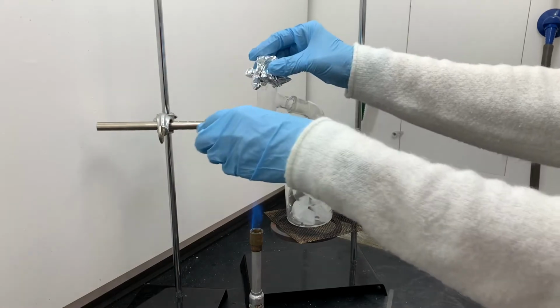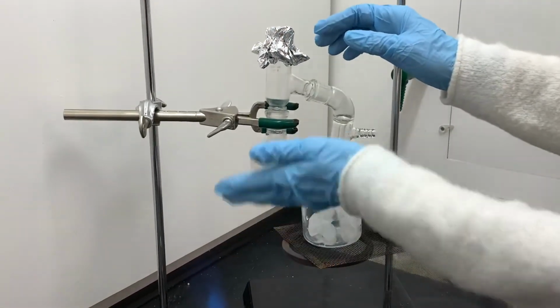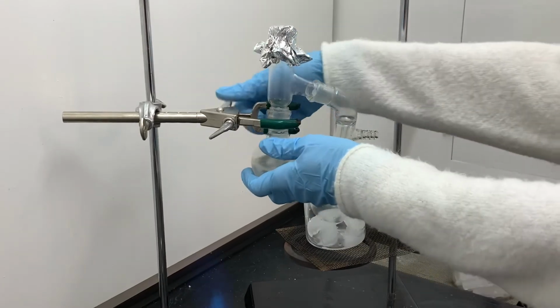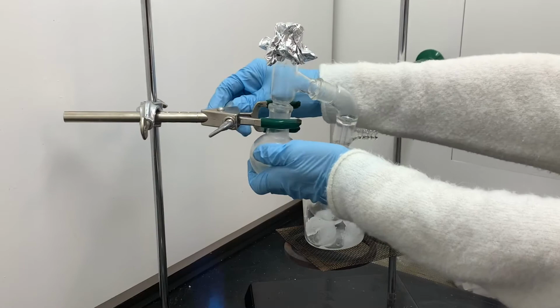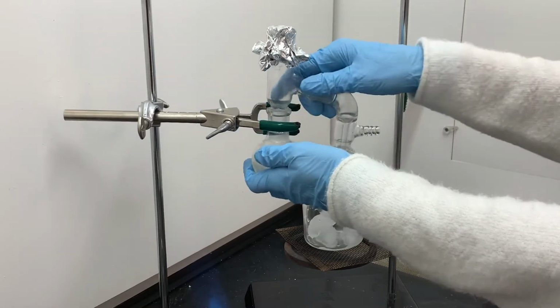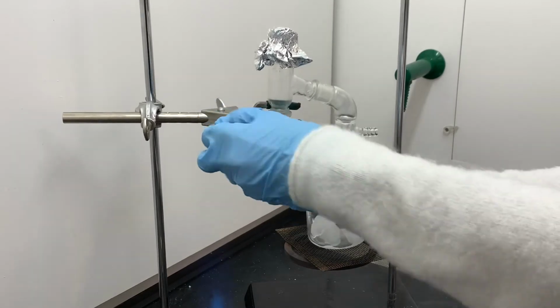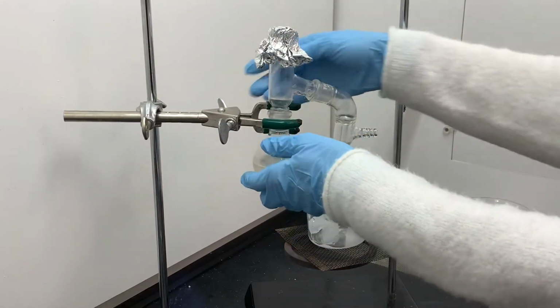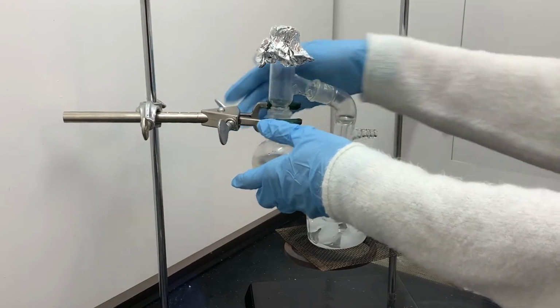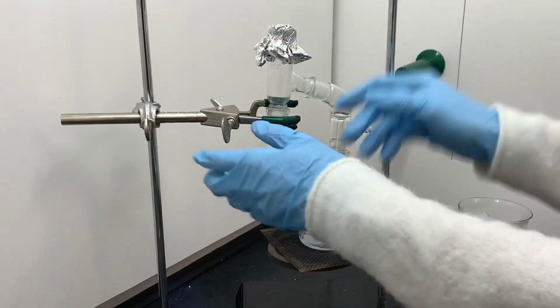You might be wondering why I'm even using a Bunsen burner in this case when I could have much better heat control with a hot plate. The only reason that we're not using a hot plate in this situation is because there's no room for it. With that receiving flask needing to be in the ice bath, it's just not physically possible to have a hot plate underneath that reaction flask. So the only option here is to use a Bunsen burner. You just have to use it really carefully.